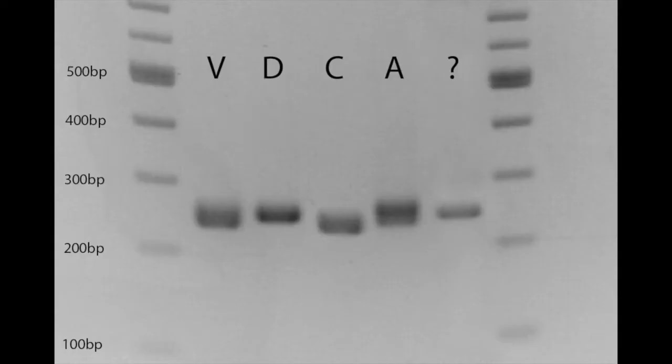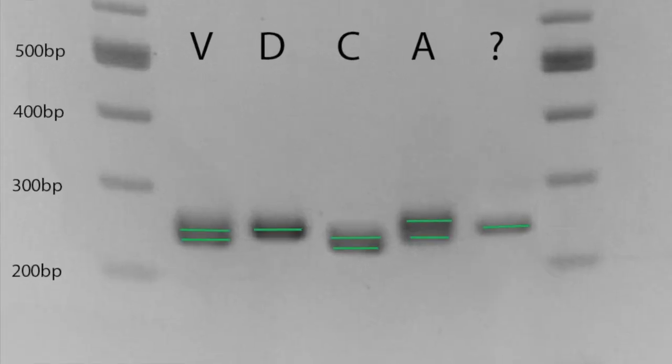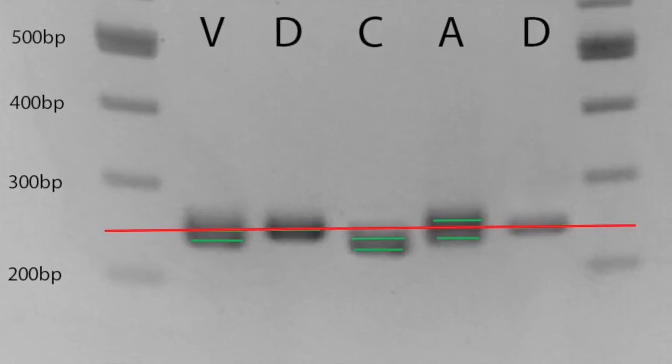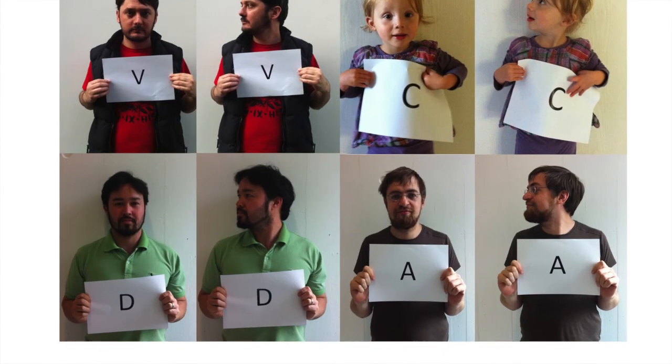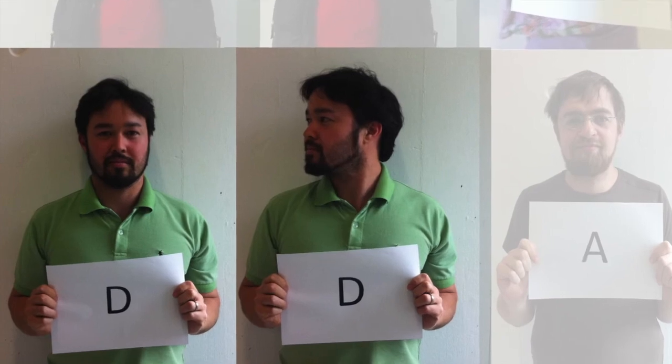Then we load our samples into our gel. We also load up the suspect's DNA, and now it's time to run the gel. We end up with bands for each suspect. Each suspect has 2 bands, although they can overlap. The DNA from the crime scene only matches one of the samples from the suspects, and that happens to be me. So the mystery's been solved.